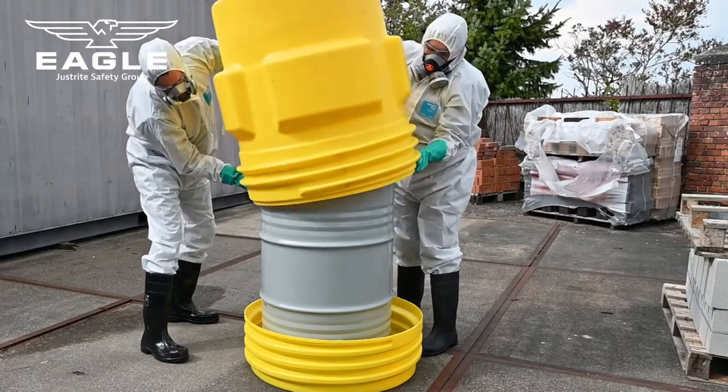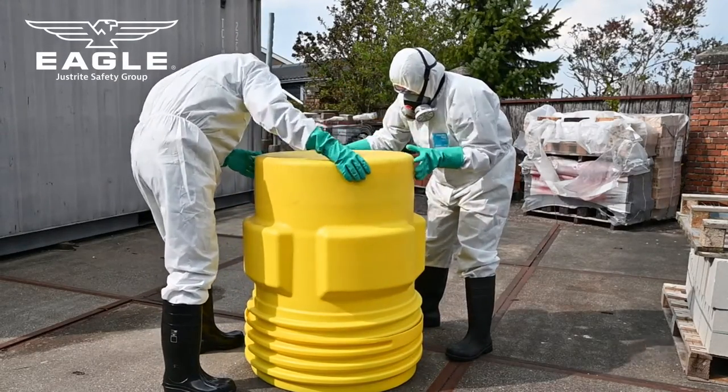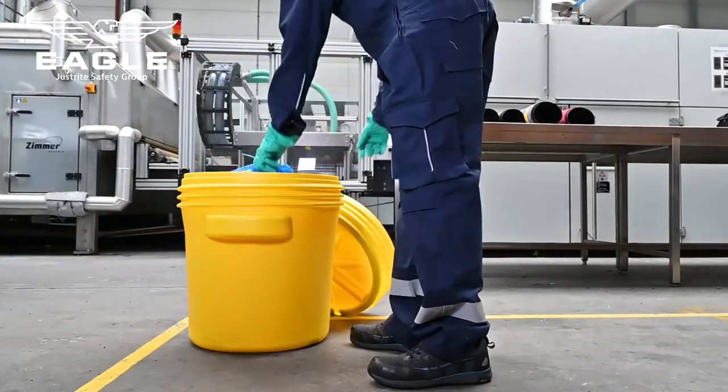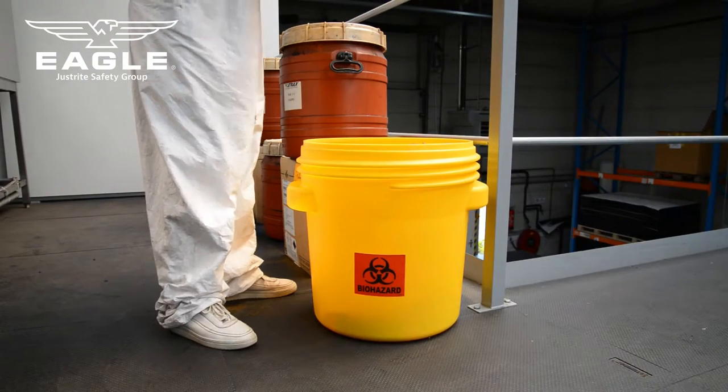Overpacks and lab packs can be used as a secondary containment system for damaged or leaking containers to safely transport the contents to a disposal facility. The use of overpack drums ensures that the hazardous material does not come into contact with the environment, preventing any further contamination or pollution.